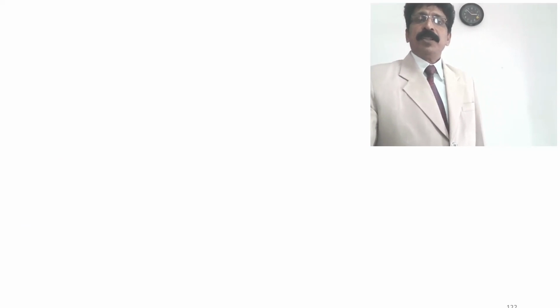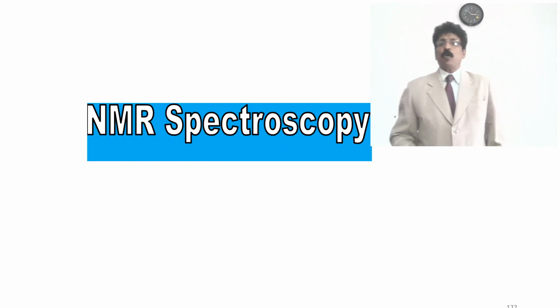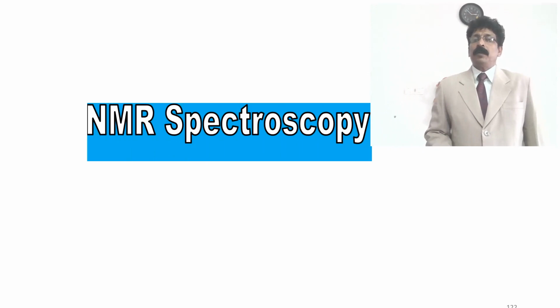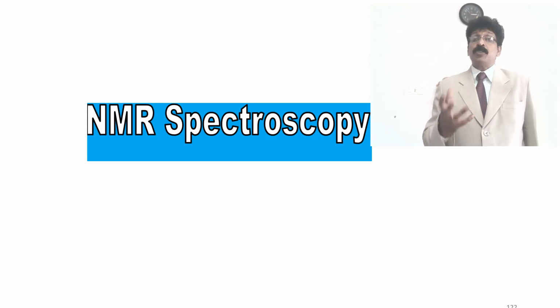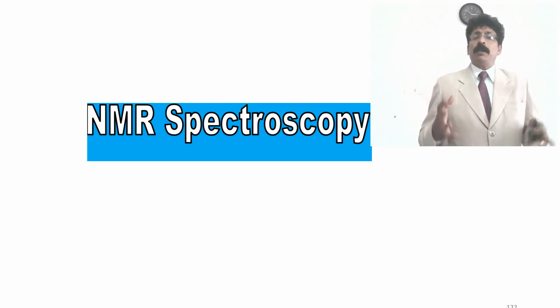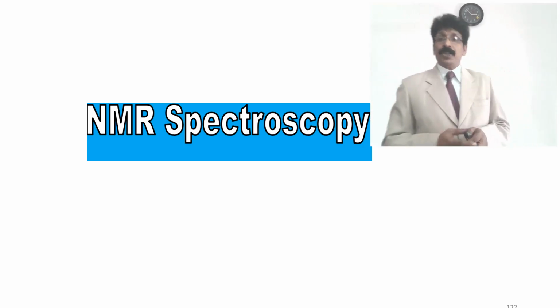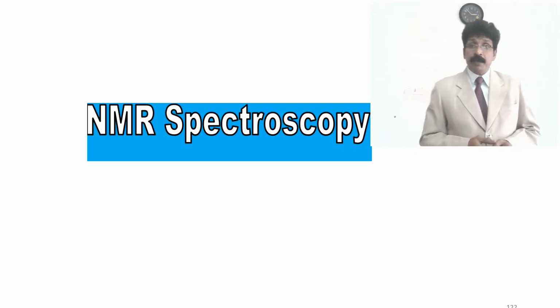In this class, we will see how NMR spectroscopy is applicable to the characterization of isolated natural compounds. We need to know the basic principle behind NMR spectroscopy and its application towards the characterization of isolated natural compounds, and what type of structural elucidation can be performed. We are keeping it short.